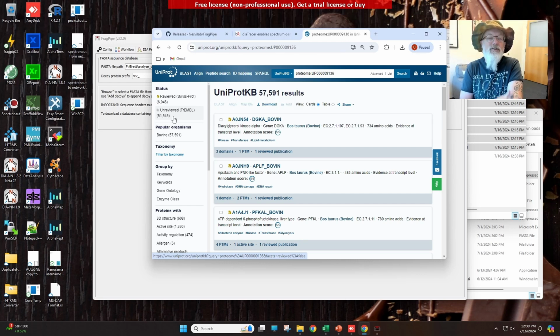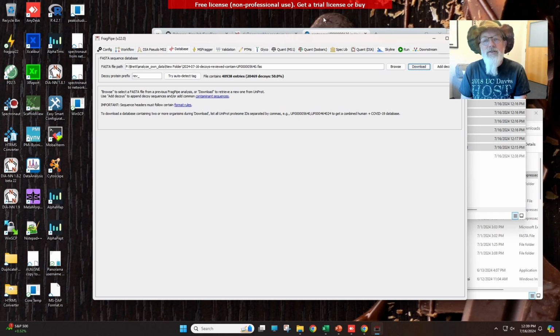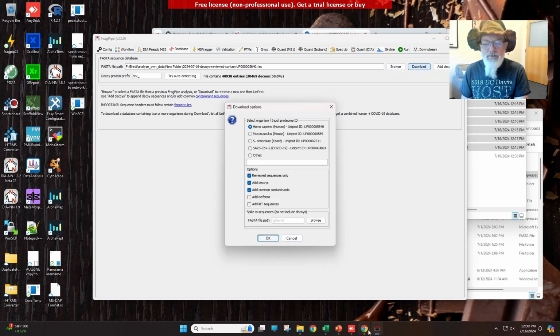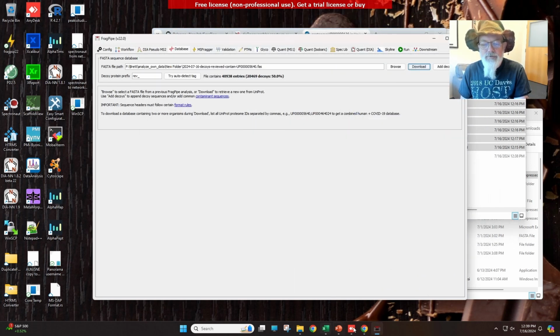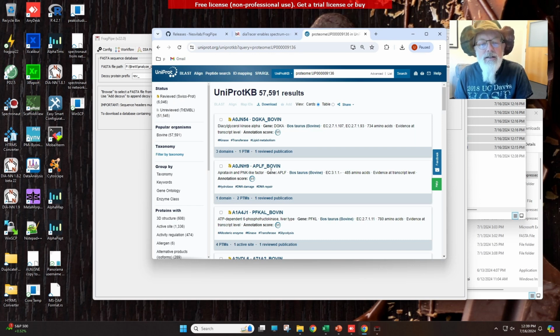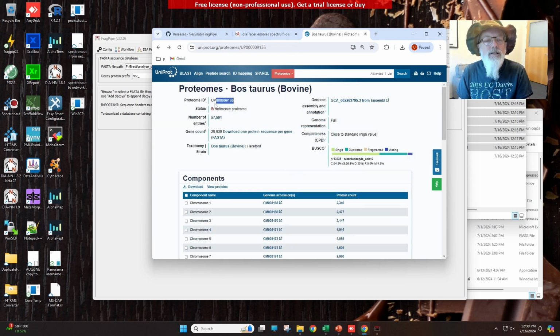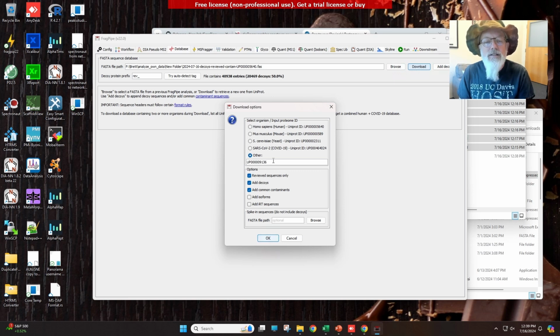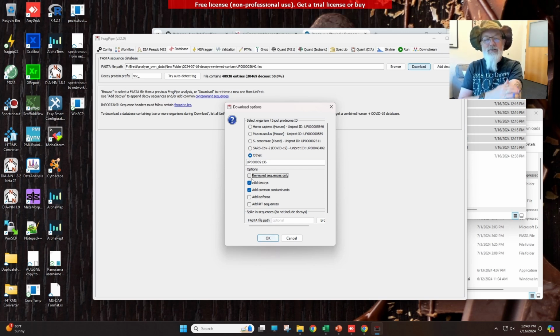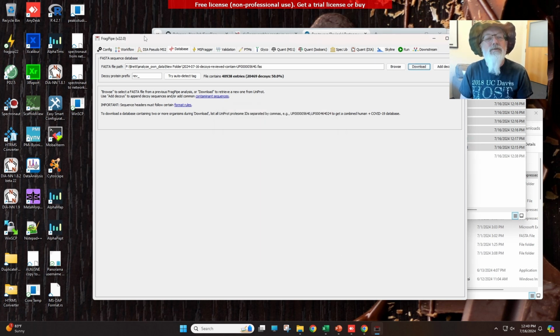So be very careful. If we were to download cow sequences, this would be UP000009136. We go other, 9136, and we don't want to do reviewed only because it would only download 6,000 sequences and then you would be screwed. So you can uncheck this if we were to search for cows, but since we already downloaded human, we will not.